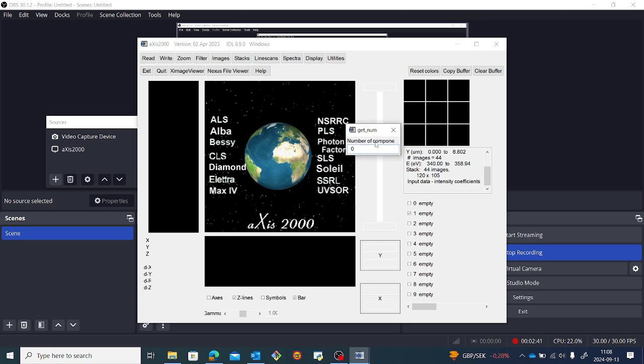The software will ask me a number of components. The number of components are the components or the chemical species that you want or that are contained in your sample. This depends on how many and what type of reference compounds you provide during your data analysis.